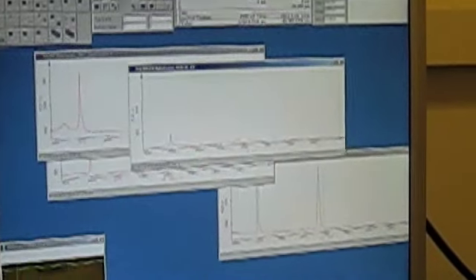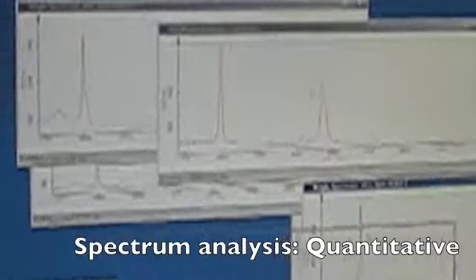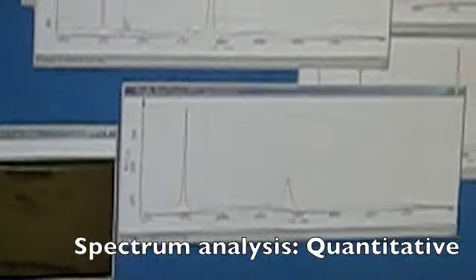Inelastic scattering, aka Raman scattering, is when the wavelength of the scattered light is different. A spectrum analysis of the light intensity and wavelength can quantitatively determine whether there is a single layer or multiple layers.